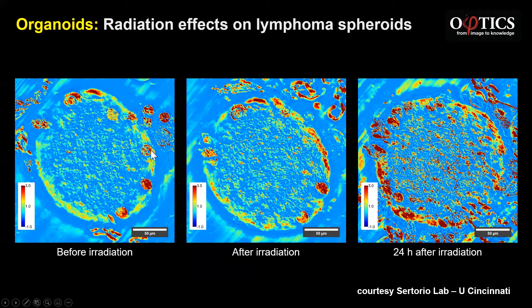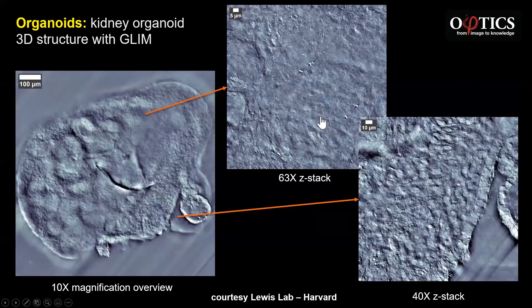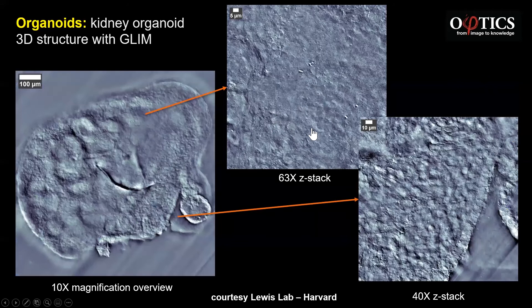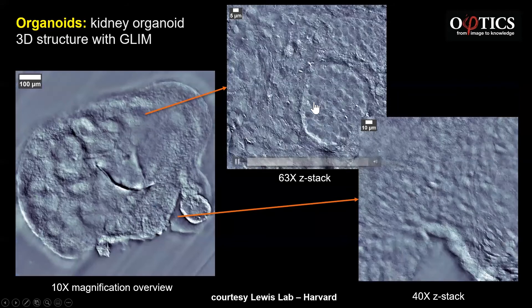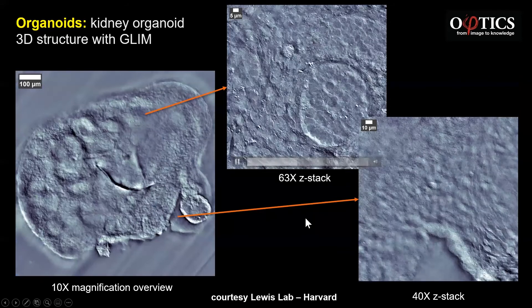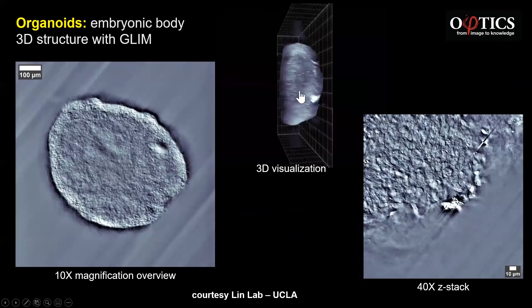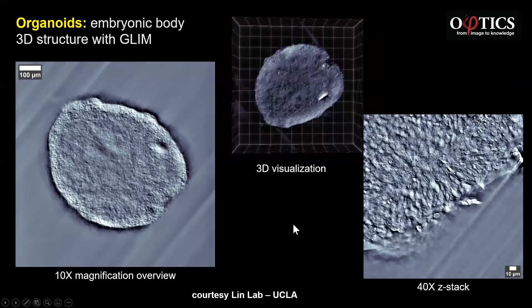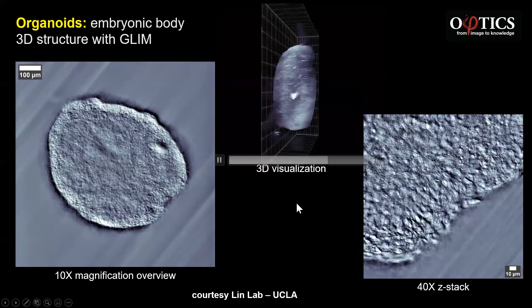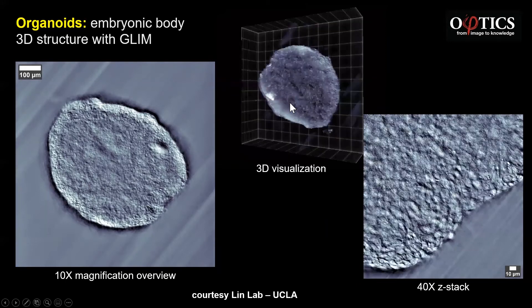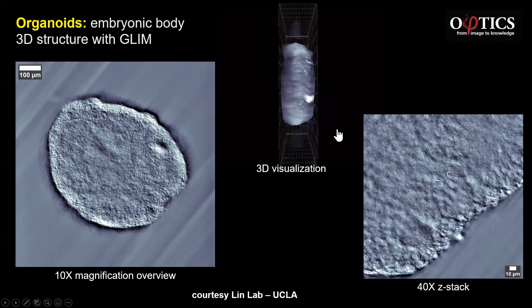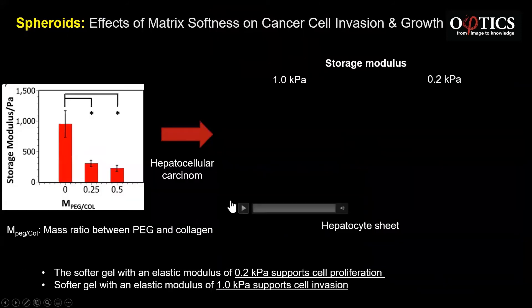This is a kidney organoid from Harvard. They were excited to see these cellular and subcellular structures in this Z-stack — particular structures that are specific to the kidney. This is an embryoid body from UCLA — the idea is to be able to identify single cells and potentially subcellular structures and study their dynamics.